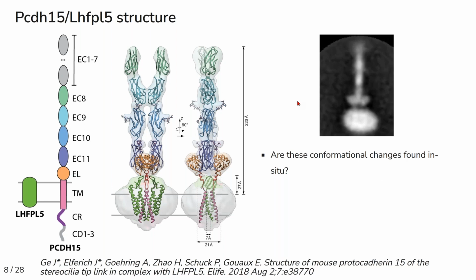And I think that's a general crux that applies to most structural biology. But the more pressing problem was that despite substantial efforts, there is no structural data available on any of the other components of the channel. So this really hampers our understanding of how a mechanical stimulus can open a channel. And when I say substantial efforts, we tried everything. We co-expressed all the components, and they just don't assemble in heterologous cells.